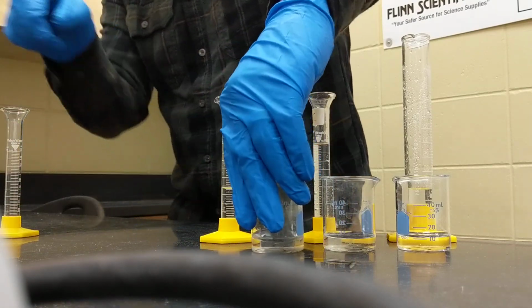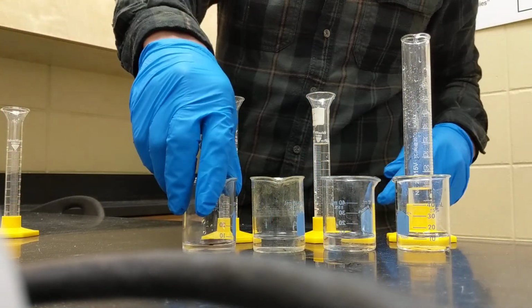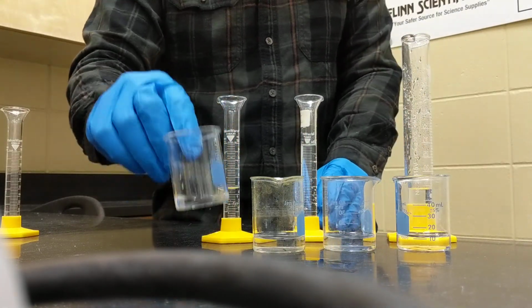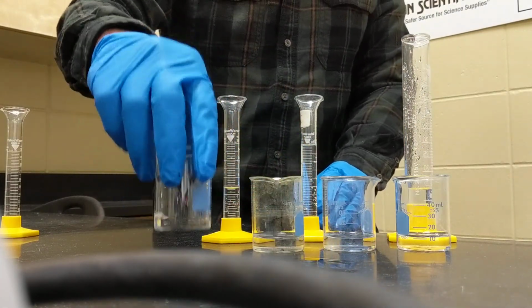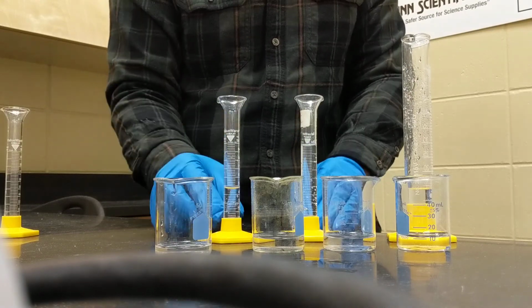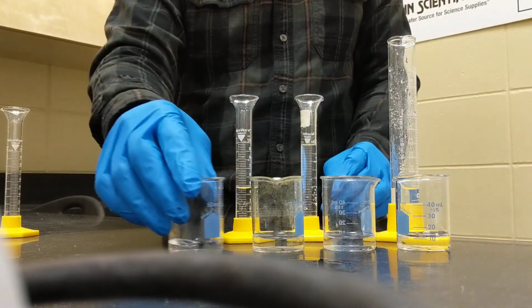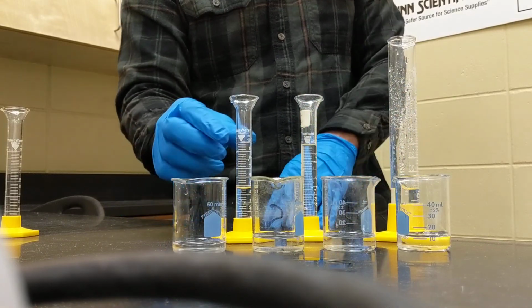That being the case, we'll switch that one and make that our control. I make lemons out of lemonade. All right, there we go. So this is our new control. This has a little bit less hydrochloric acid, but because nothing's being added to it, it won't have any type of result, but we're going to use that as our comparison to the other ones.